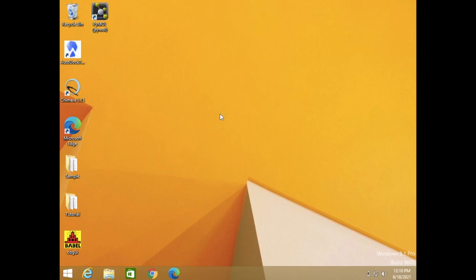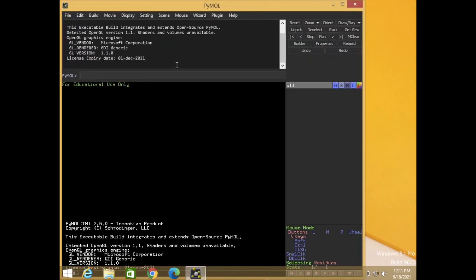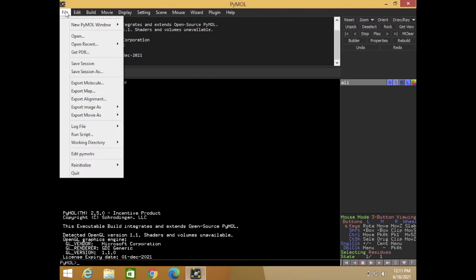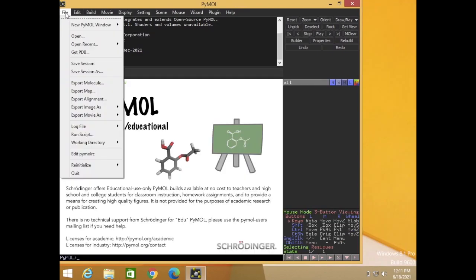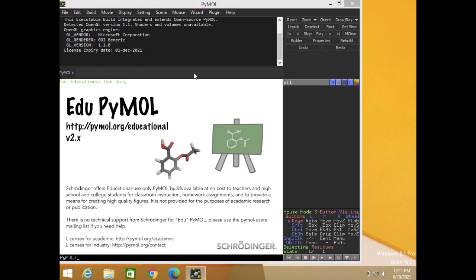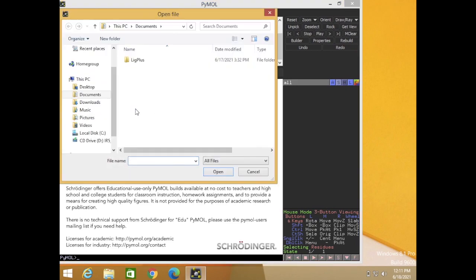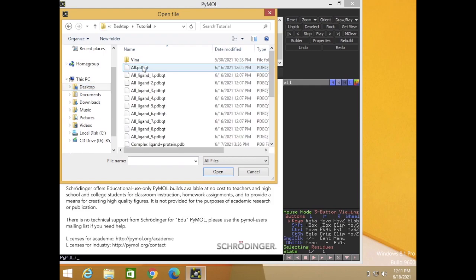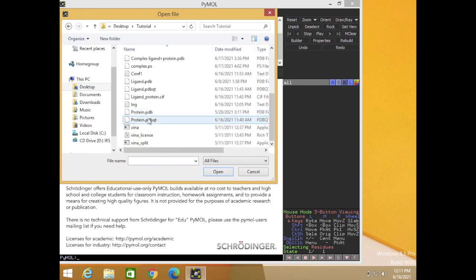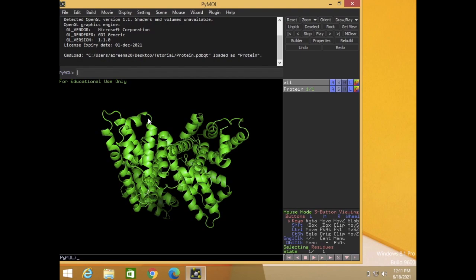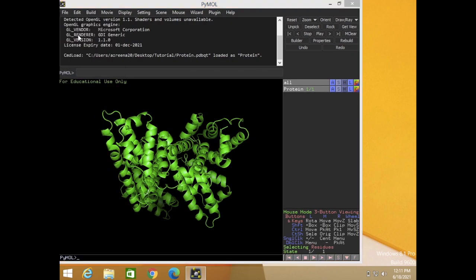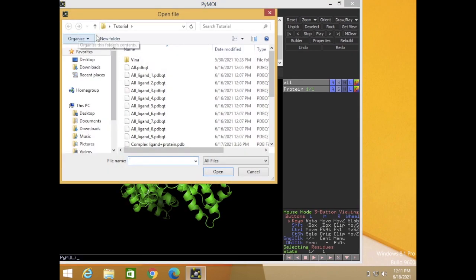First, we create the complex of the output from ligands and protein. So open your PyMOL and insert your protein file. Okay, this is the protein file. Next, insert your output file which is specific for pose one.